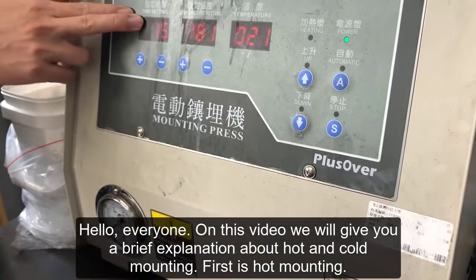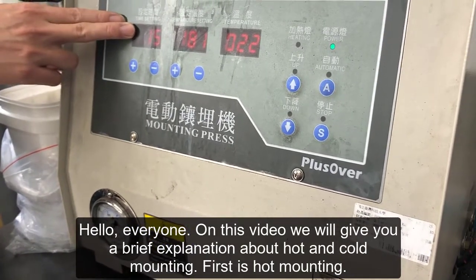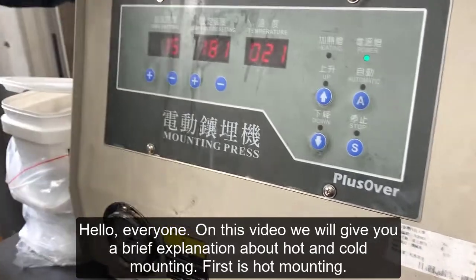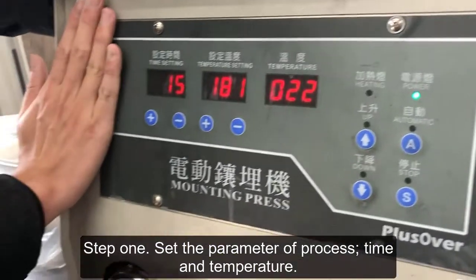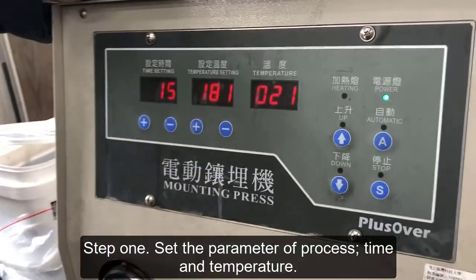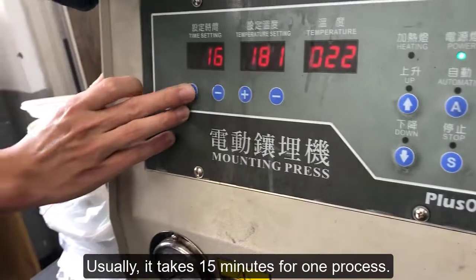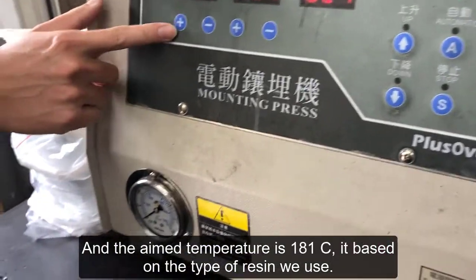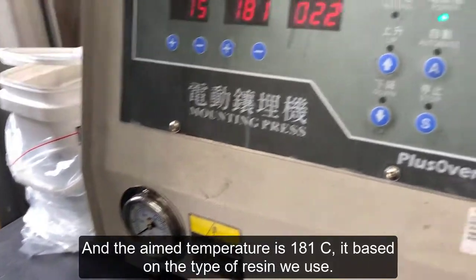Hello everyone. In this video we will give you a brief explanation about hot and cold mounting. First is hot mounting. Step one: set the parameters of the process, which are time and temperature. Usually it takes 15 minutes for one process. The aim temperature is 181 degrees Celsius, based on the type of resin we use.